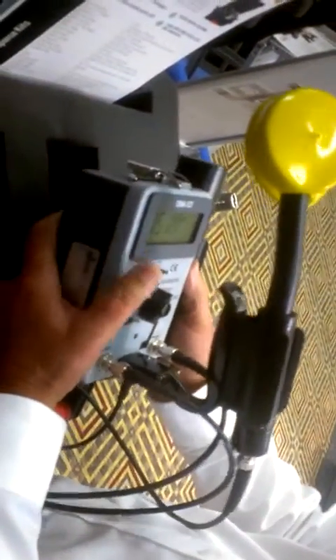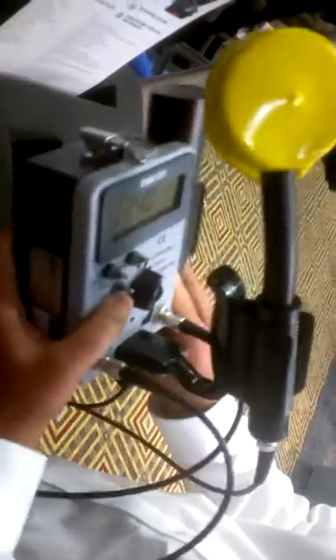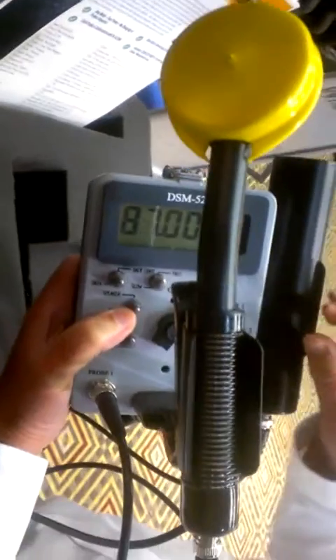Alright, this is our 5DSM-525 with two probes hooked up at the same time, both of them live.